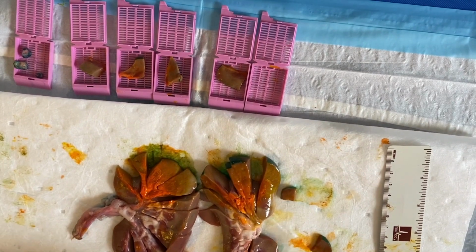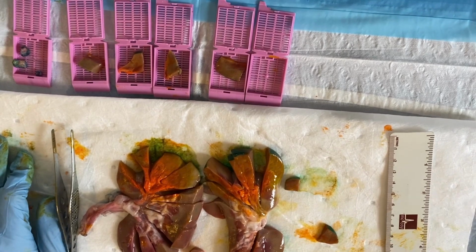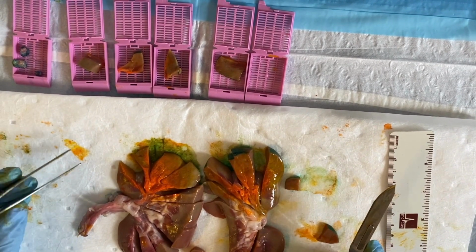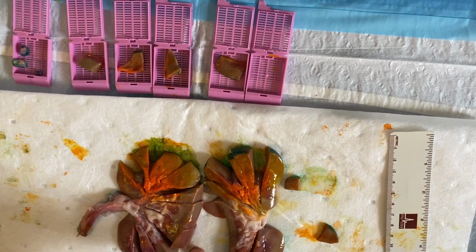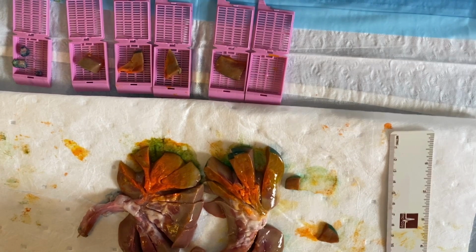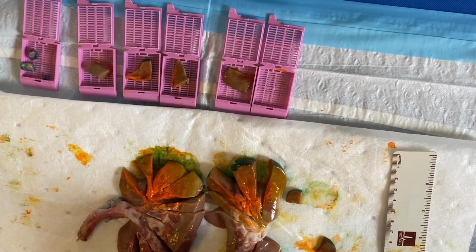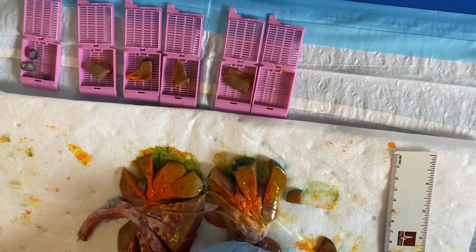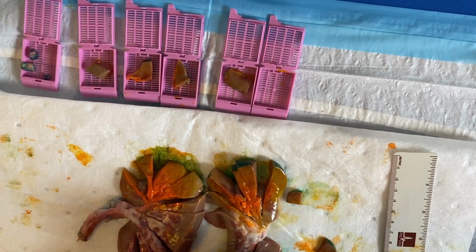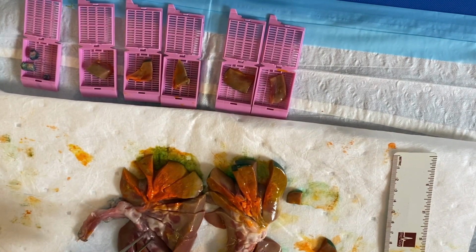All right, and now I need to make sure that I, of course, change my blade. In a human specimen, I'm not going to do that right now, but I would change my blade because you don't want to contaminate normal tissue with tumor cells. So I would make sure to get uninvolved inferior pole. And that has cortex and medulla. Great. And uninvolved renal pelvis.